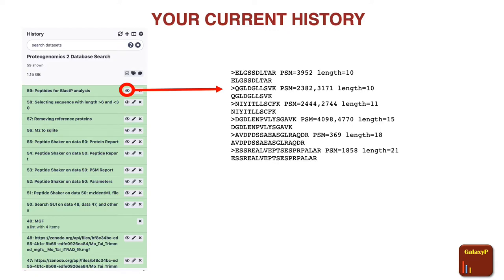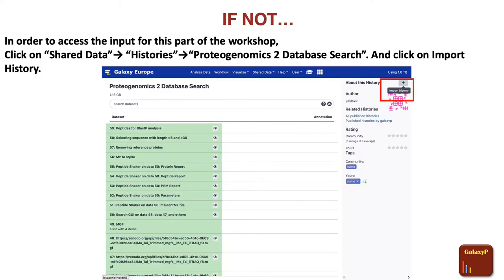If you have completed the second tutorial of proteogenomics, this would be your current history. It will have all the tools that you have run and the last output should be the peptides for BLAST analysis. This is how the output should look — you're left with the FASTA file that has to go through the BLAST-P analysis. If you do not have that file, do not worry, we have already shared this information with you. Go to shared data, click on histories, and go to the Proteogenomics 2 database search and import this history.